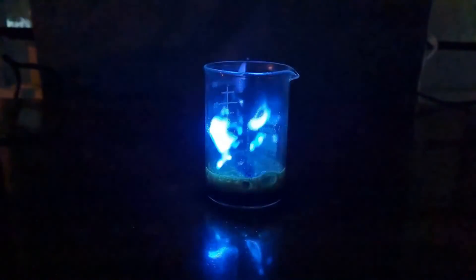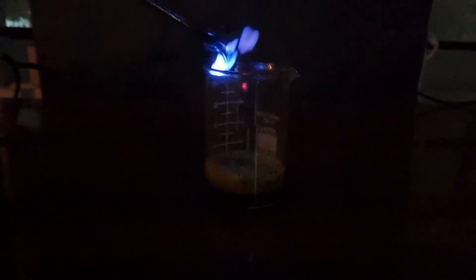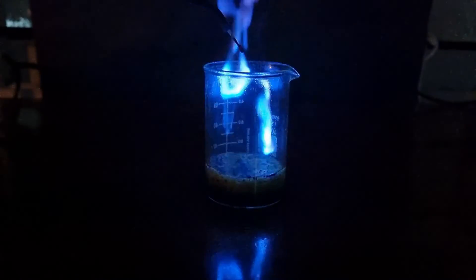Let me show you this once again. Here I have the aluminum and I'm going to drop it inside. You could see how beautiful that was.